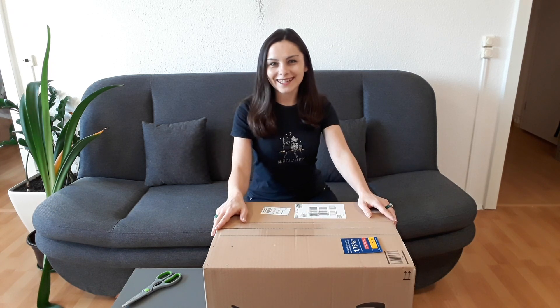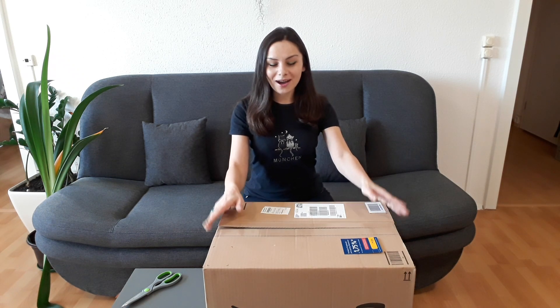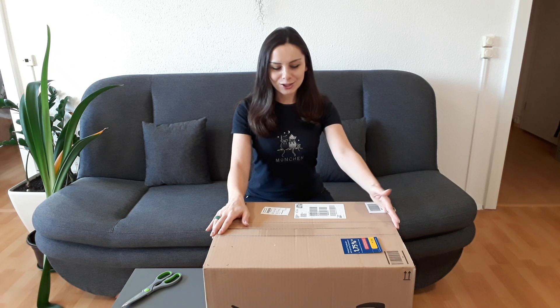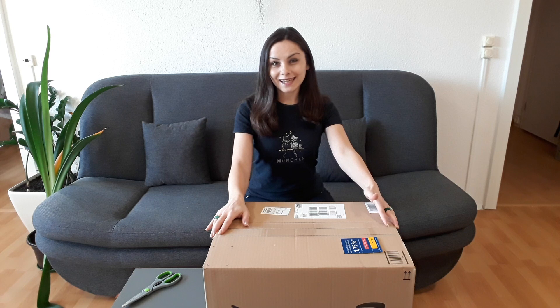Hello my friends, welcome to Honest Violets! Today I'm here with another box, and no, it's not a plant today. I'm going to unbox this wonderful microscope — this should be a Swift SW-350T and it's 40x. So let's start!